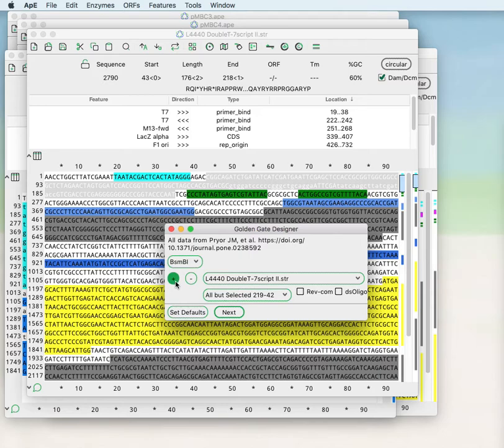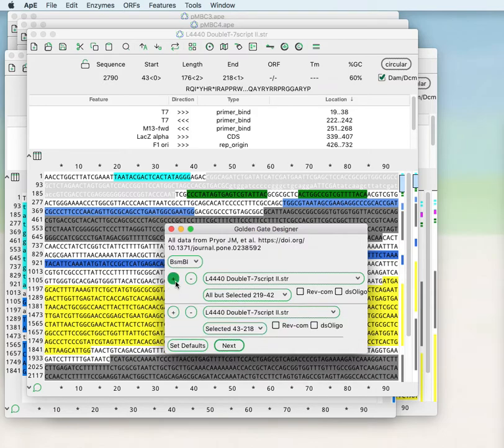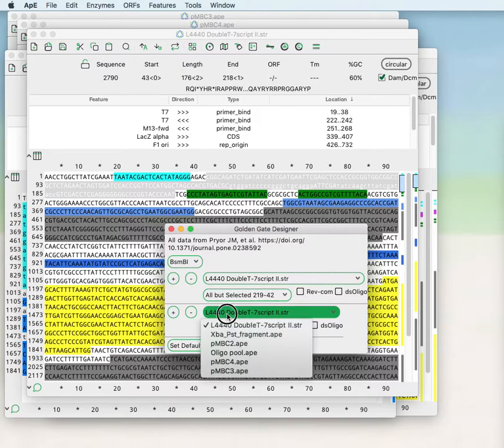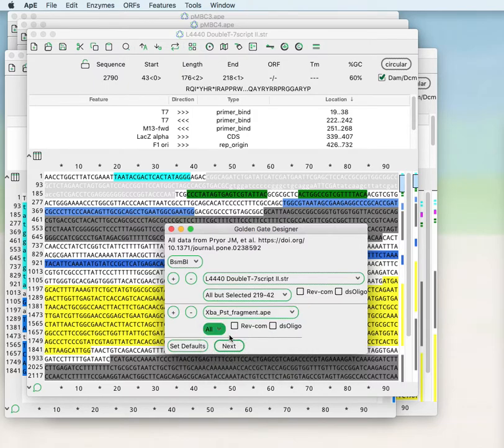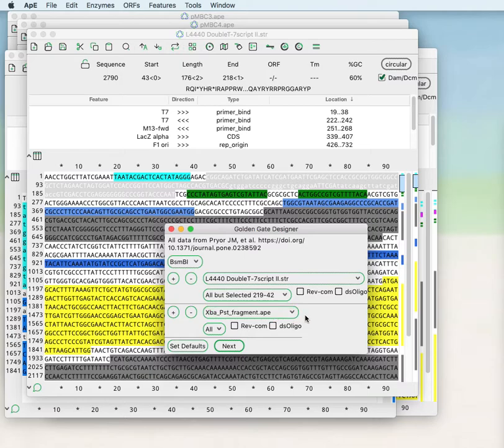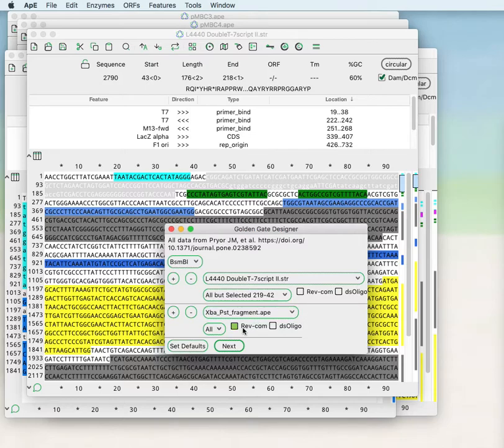If we choose BsmBI we find that the designer says that that fragment is OK. Now we can add an additional fragment to our Golden Gate reaction. In this case our Xba Pst fragment also from the previous restriction ligation tool demonstration.